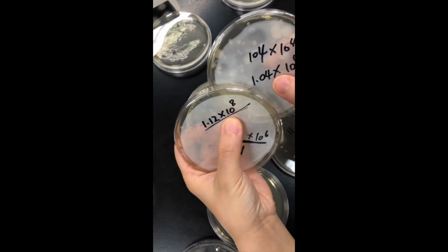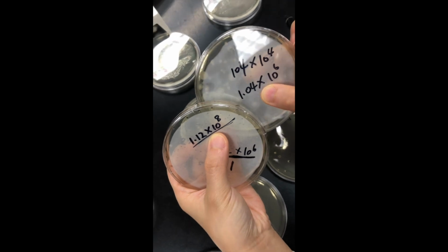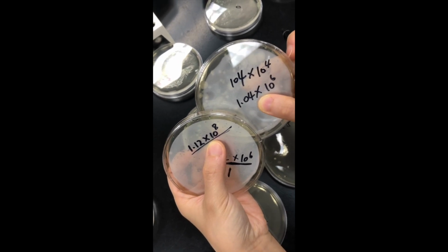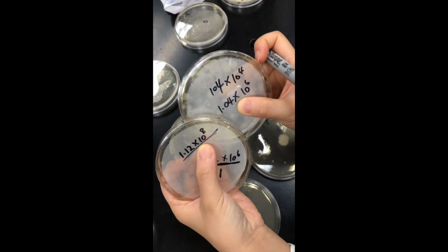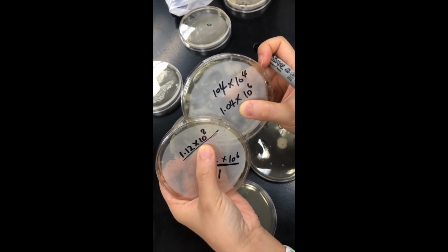Please compare these two numbers and see whether pasteurization works and whether it meets our standard accepted range for pasteurized and unpasteurized raw milk samples. Please have the answer in your lab report, and we'll see the result.